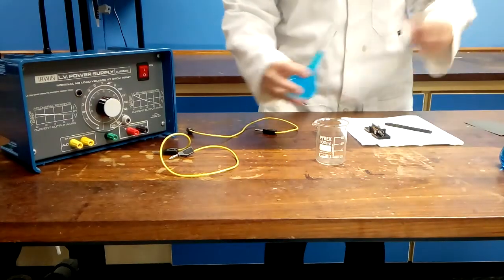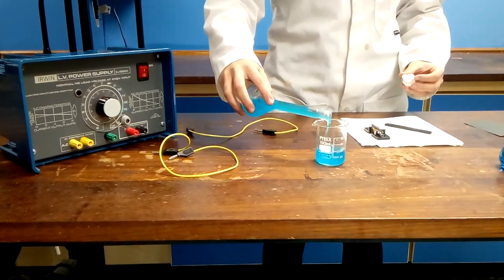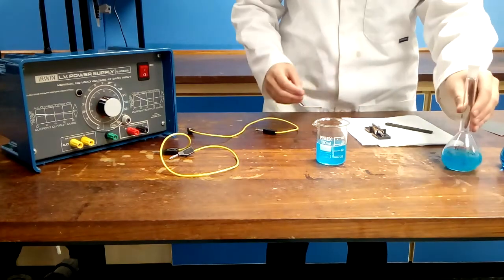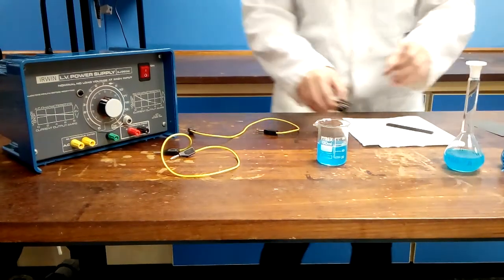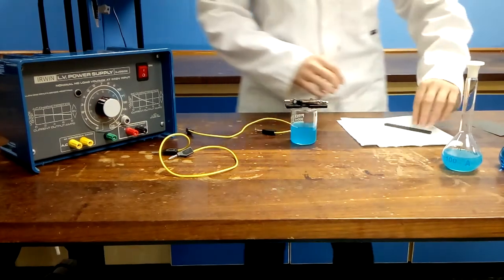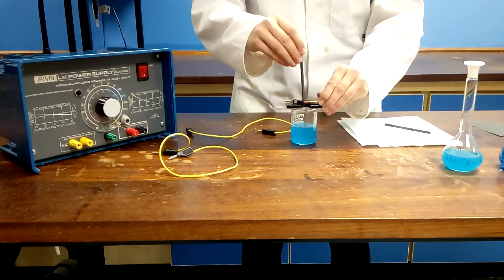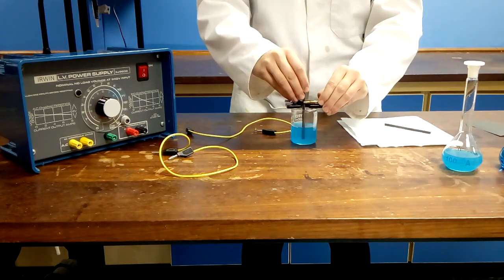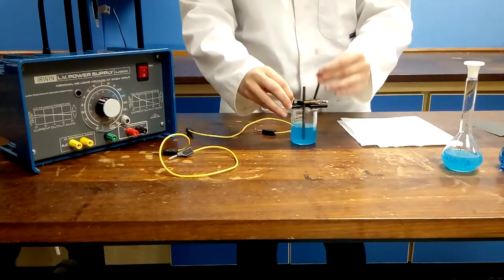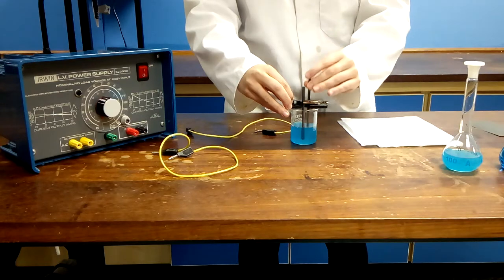Pour your first salt solution of copper chloride into the 100 centimeter cubed beaker until it is half filled. Use the equipment provided to suspend the carbon electrodes into your solution. You must make sure that the carbon rods are not touching each other and that they are both partially submerged in the liquid.